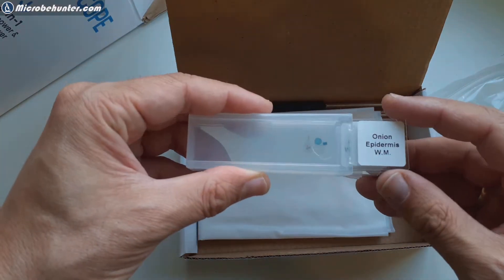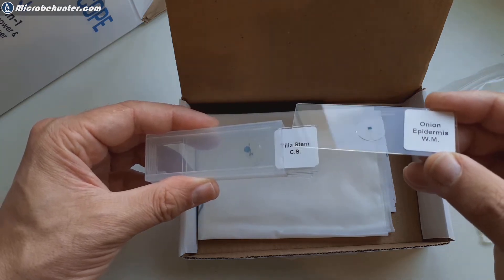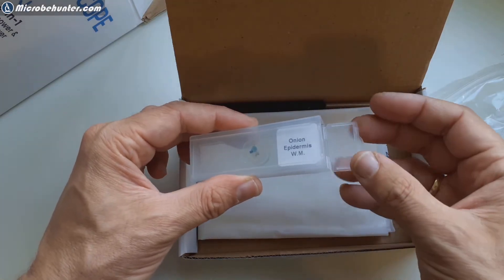As a matter of fact I'm going to be looking at them later on in the video and I'm going to put them under the microscope and I'm going to show them to you. So but for right now I'm going to put them back and I'm going to check what else is in the box.